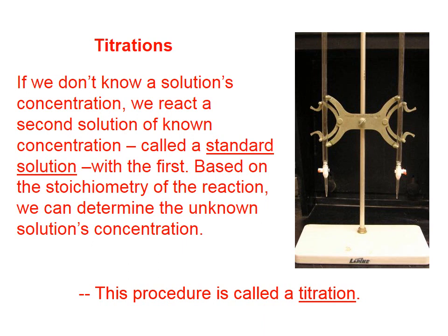looks like. We have two burettes, one perhaps filled with acid, another filled with base. We have a double burette clamp right there, all of that attached to a ring stand.